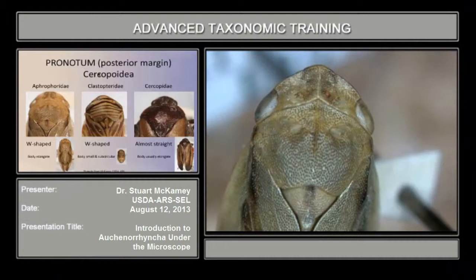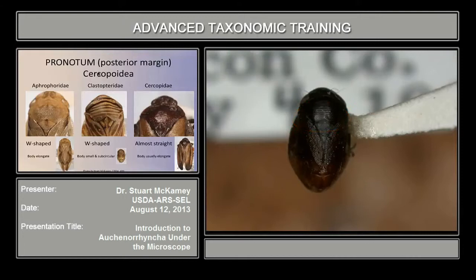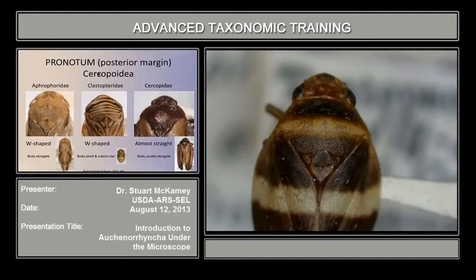Now looking at the pronotum of Cercopoid families — frog hopper families — we're going to look at the posterior margin of the pronotum. In Aphrophoridae, which are generally elongate, the posterior margin is W-shaped. In Clastopteridae, the pronotum is also W-shaped, and these are small, sub-circular species. In Cercopidae, it's almost straight across. There are two other families, but they've never been intercepted. Here's another example of Cercopidae with the almost straight posterior margin of the pronotum.